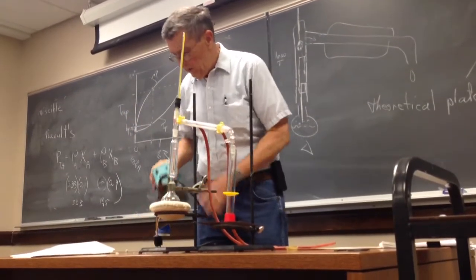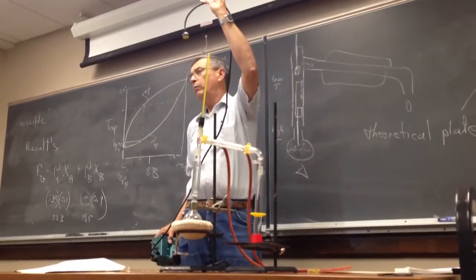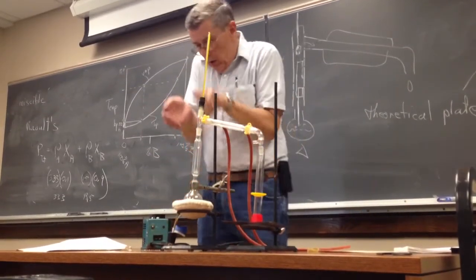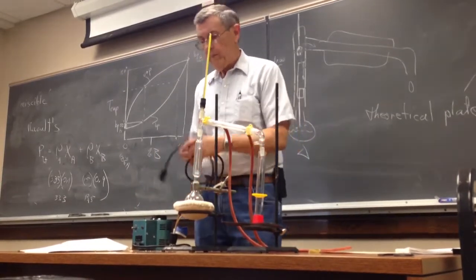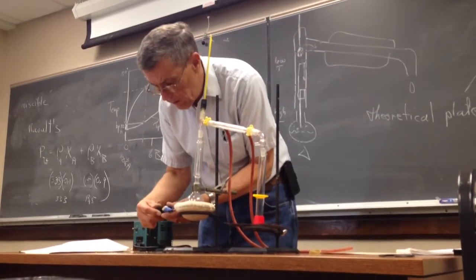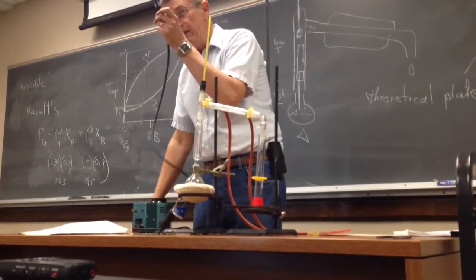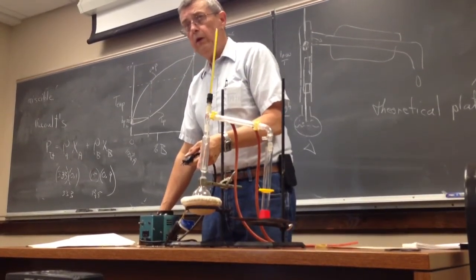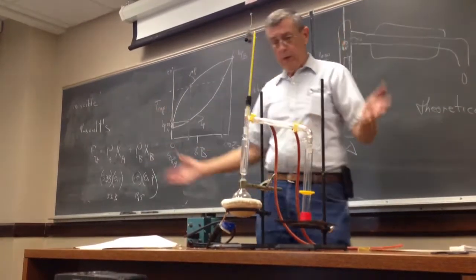So that's here. It's got a plug here that presumably connects to that. It's got a plug here that goes to the wall. Just looks like a regular plug, so that goes to the wall outlet. If you look at the heating mantle, the plug on it has curved prongs. This has standard straight prongs. This goes on here, and it has a big one and a little one, so you've got to line those up. Which one's the big one? That's the big one. And that goes on like so. Do not plug this into the outlet, because you'll get full voltage and you'll burn that $125 mantle. So unless you want to buy a burned out mantle, I would not do that. Plug it in here instead, and then you're pretty much ready to go.